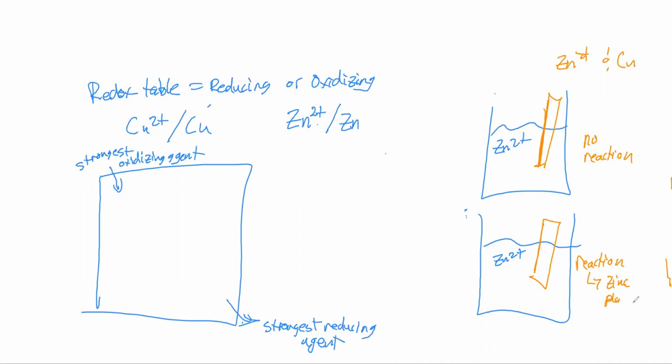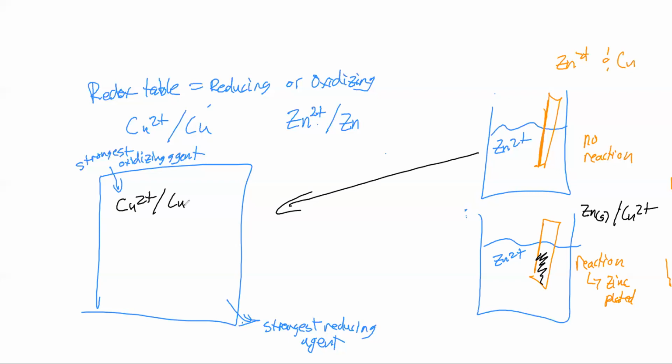So that means that zinc solid formed on our copper, then that means that our zinc preferred to be a solid and the copper was in its ions. So when we want to compare them, for this top one, its redox table looks like our copper 2+ goes to copper is better than our zinc 2+ going to our zinc, right? We would prefer for this top one to be going in that way to make our copper solid, while our bottom one should remain as our ions.